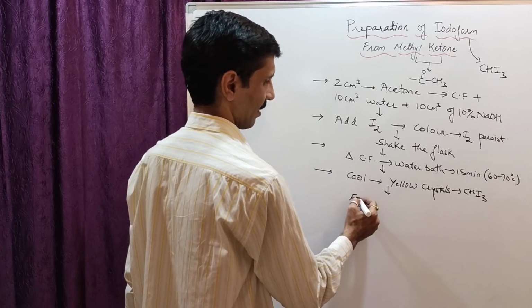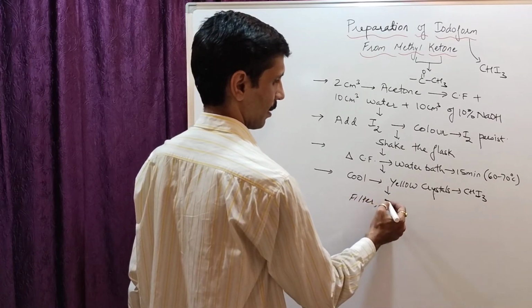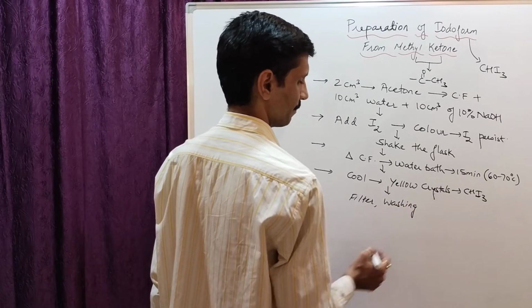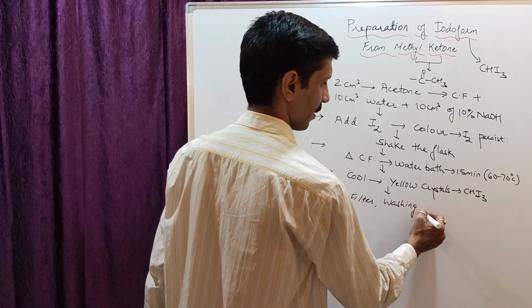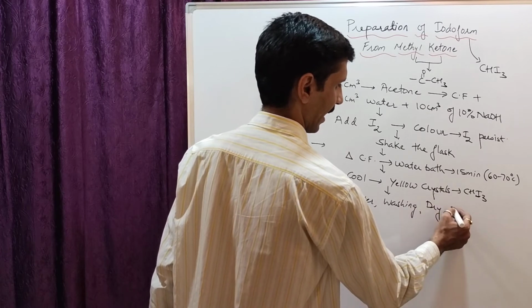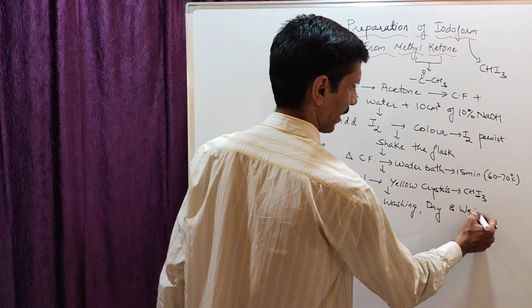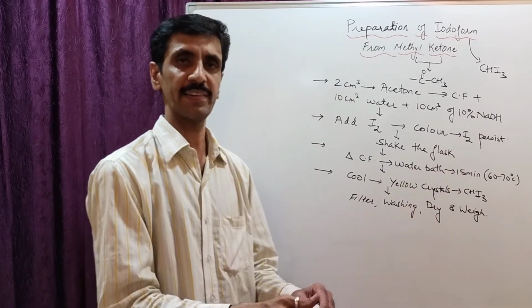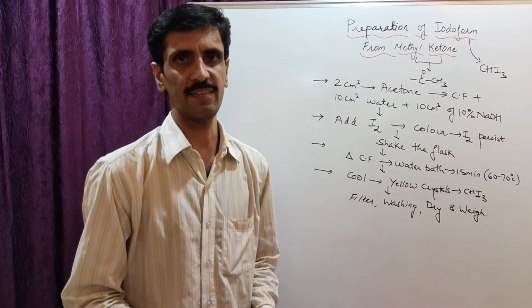Next step is to filter, give some washings with water, dry it, and then finally weigh it, which becomes the quantitative aspect of this particular synthesis.